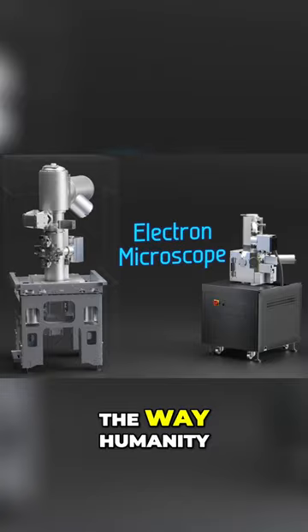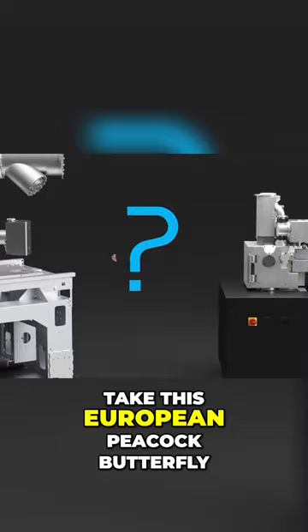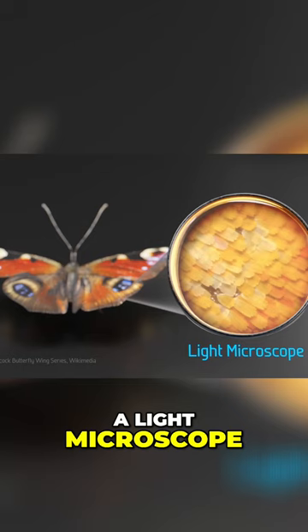Don't believe us? Take this European peacock butterfly for example. When we zoom in on its wing using a light microscope, we see that it's composed of tiny overlapping scales.